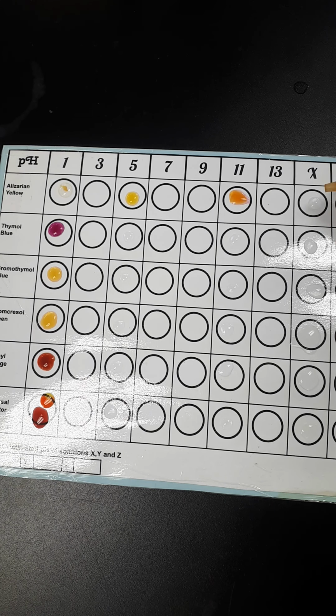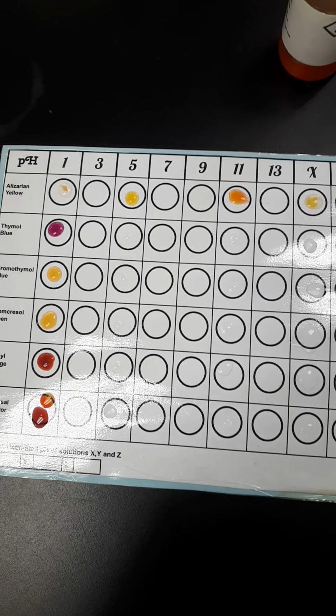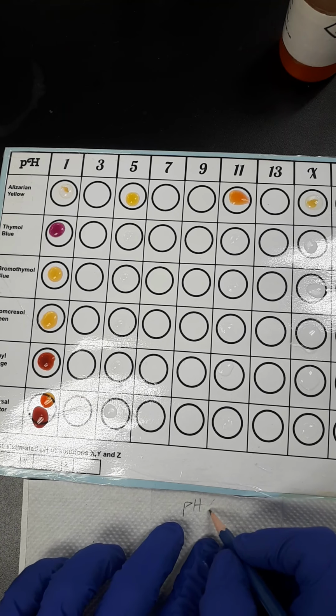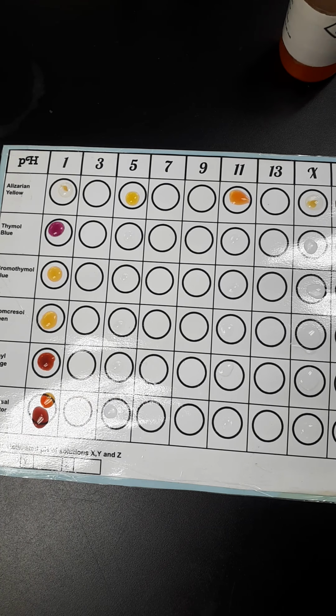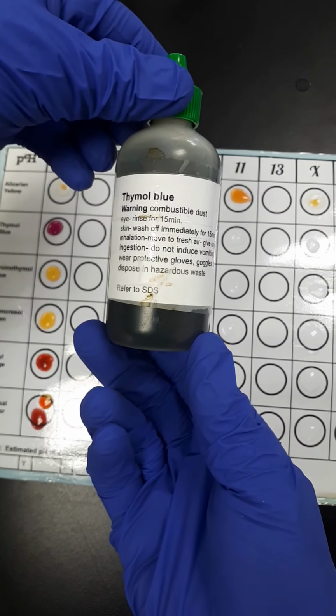And then let's check out our unknown X and see what that looks like. Unknown X is yellow. So what does that tell me? That means that it has to be less than, alizarin yellow, it has to be less than 10.1. And you know what? I'm even going to write that out on a napkin for us. So the pH has to be less than 10.1. Cool. Okay, we'll come back to that in a second. So alizarin yellow, done. Let's check out thymol blue.